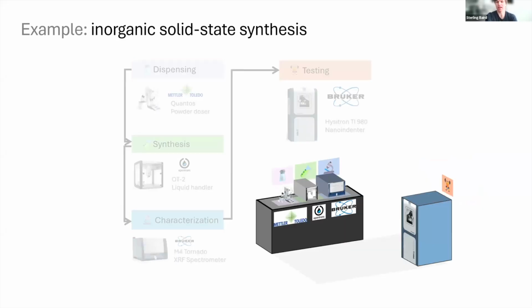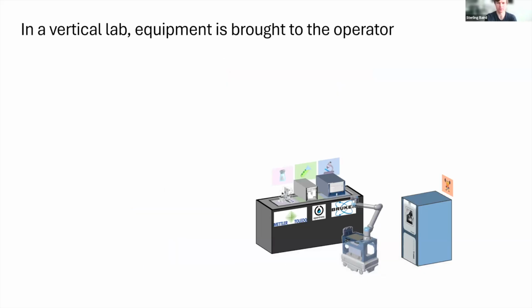And we have this typical lab bench where some are on a table, some are just kind of these freestanding modules. And oftentimes we'll see things like mobile manipulators or rails or lots of equipment kind of centered around a single robotic arm for some of these workflows.